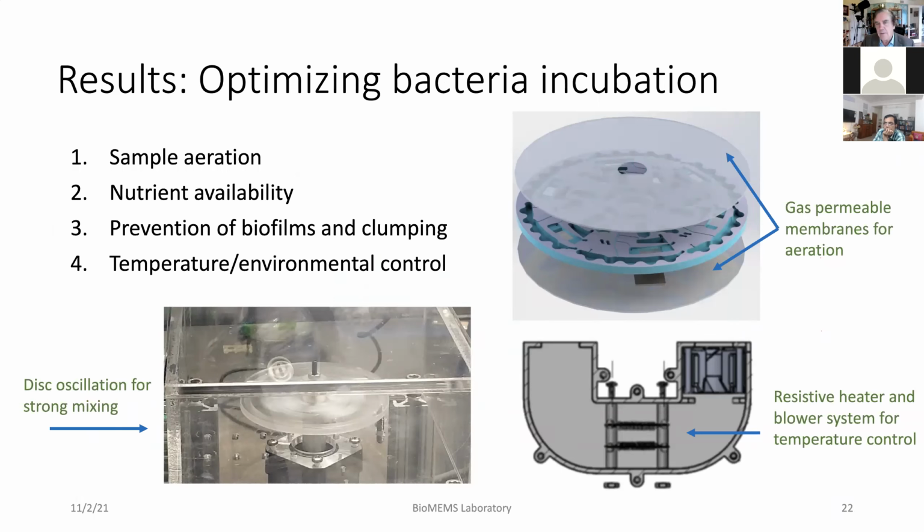This I will briefly talk about. We've also been able to speed up the incubation process. So instead of putting a traditional incubator, we have the CD put in a special reader, and we put a membrane on top and the bottom that's gas permeable for aeration of the bacteria.